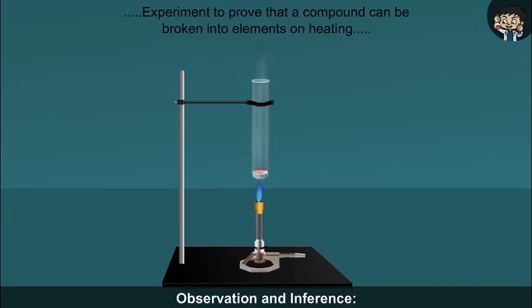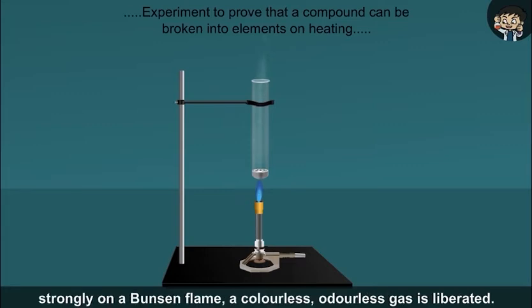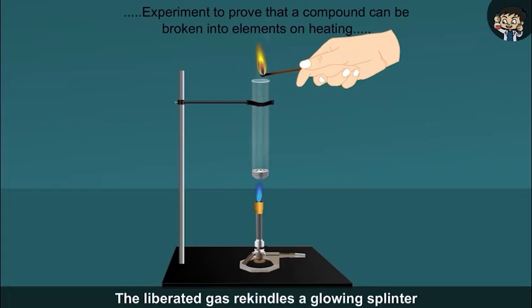Observation and Inference: When the test tube containing mercuric oxide is heated strongly on a Bunsen flame, a colorless, odorless gas is liberated. The liberated gas rekindles a glowing splinter, showing that the gas liberated is oxygen.